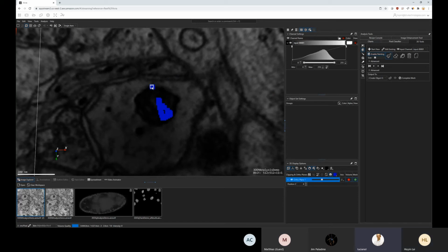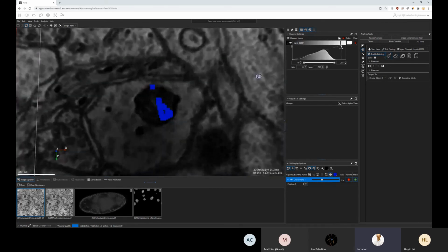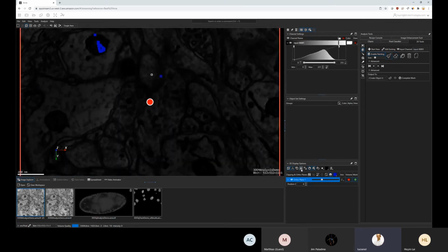I was saying that when you're on the mesh editor, it always shows a single slice to make sure that you can see it. If you want to make it brighter, just use the lookup table to make it brighter and keep it 100% orthogonal to the view. If you put it tilted at an angle, it will not look good.